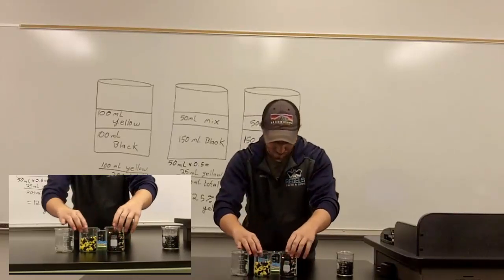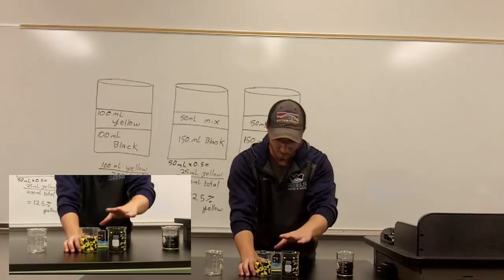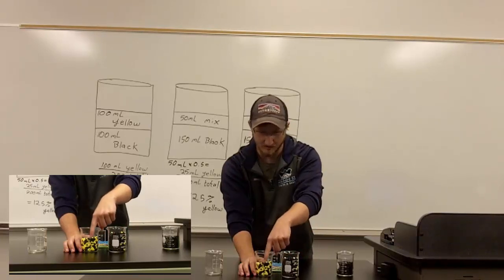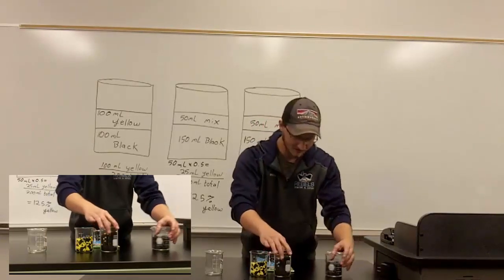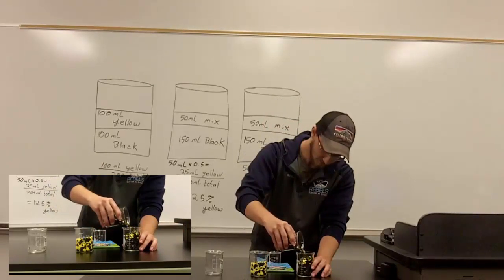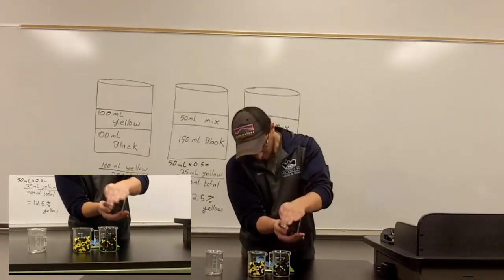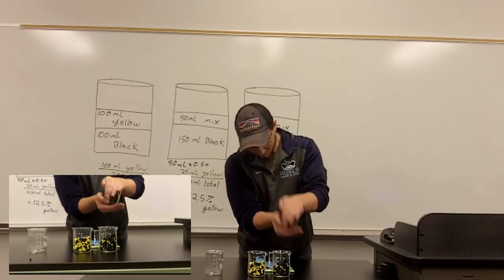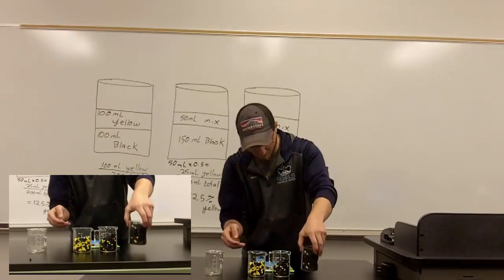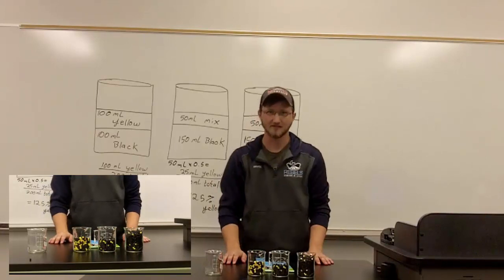And then you can already see that there is a dilution going on, about a factor of 4, so about 25% of the yellow that are in this, there should be 4 times as much concentration in this one. And then if you do the same concept with this guy, to do a second dilution, and then agitate. Should see about another 1/4. So there you have it.